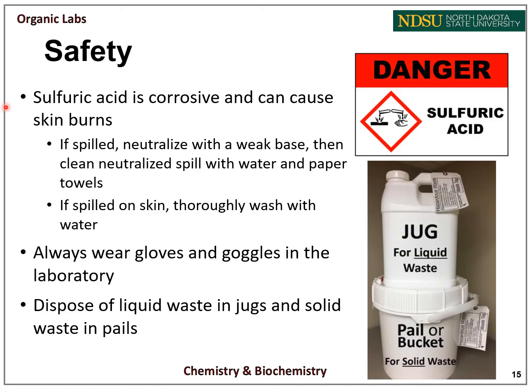They can neutralize it with a weak base, and then they can clean up the neutralized spill with water and paper towels. If it's spilled on your skin, immediately alert the TA and wash your skin thoroughly with water for at least 15 minutes. Make sure to always wear gloves and goggles in the laboratory, and at the end of the lab, dispose of your liquids in the liquid waste jug and your solids in the bucket.